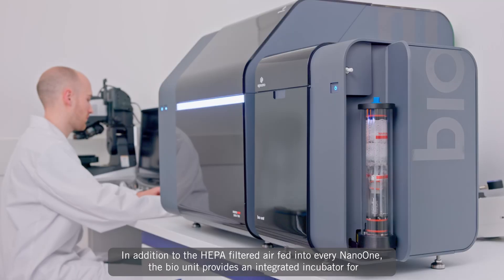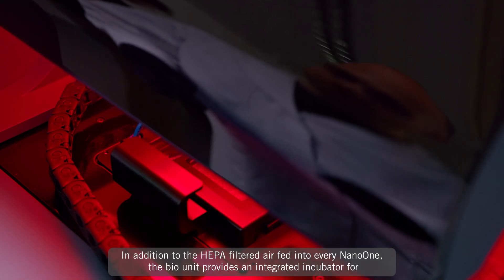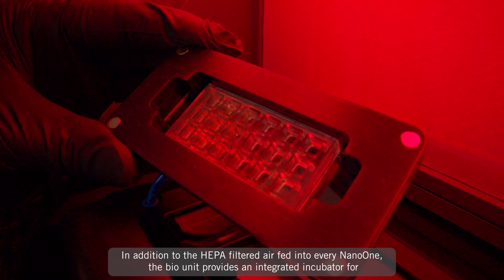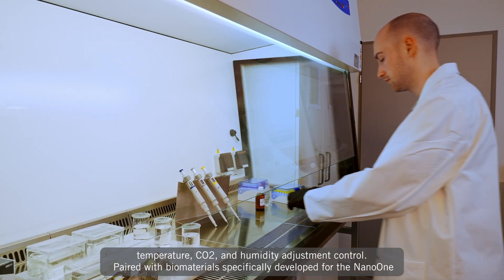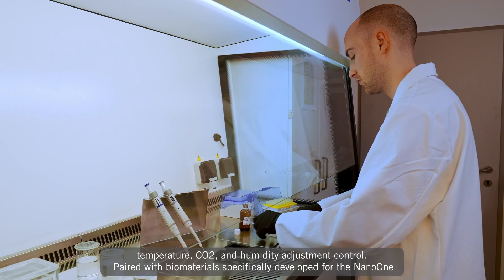In addition to HEPA-filtered air fed into every Nano One, the BioUnit provides an integrated incubator for temperature, CO2, and humidity control.